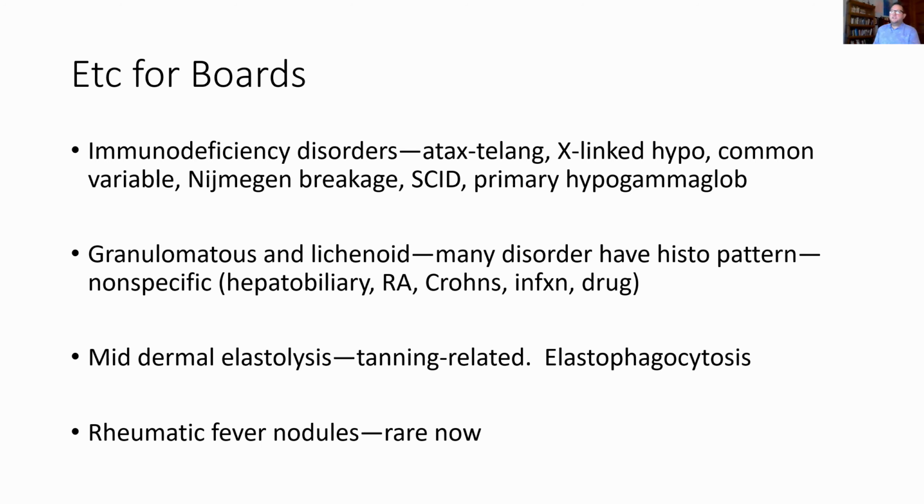But mid-dermal elastolysis, it's good to know about. It's younger women who go to tanning booths and they end up with a rash. The biopsy has a life, so there's an active inflammatory moment, and then it becomes chronic and inactive. But what you see are histiocytes that are gobbling up the elastin fibers, elastophagocytosis.